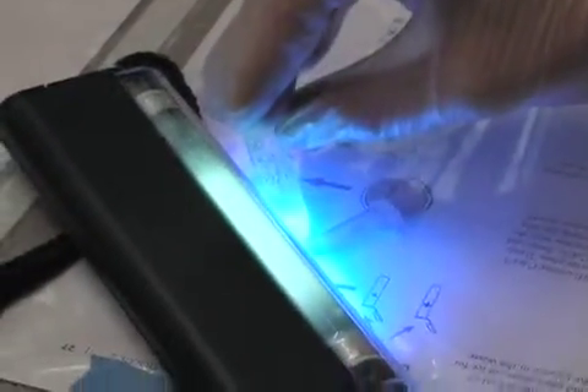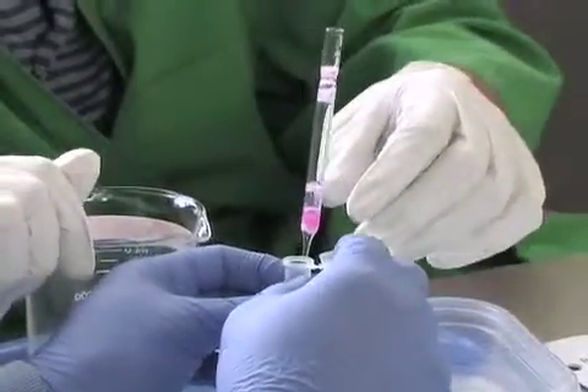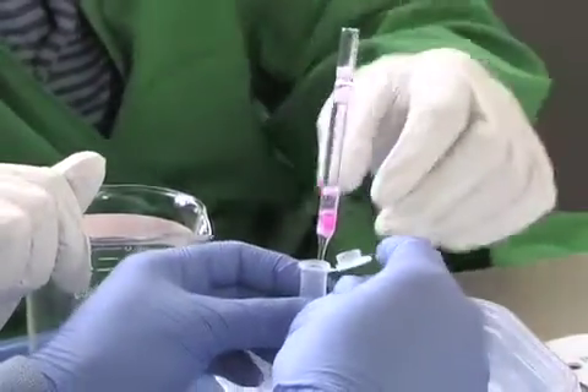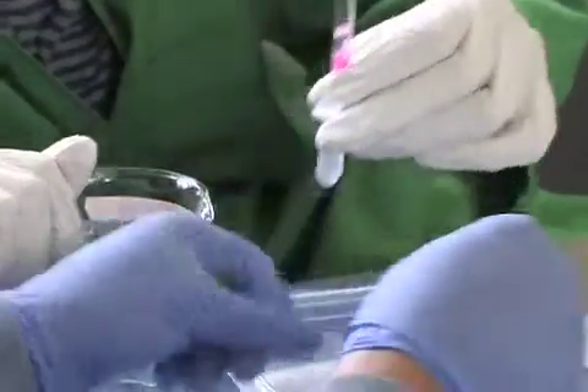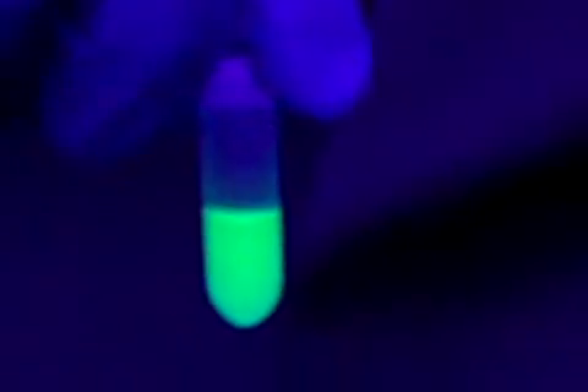To check if the fluorescent proteins fluoresced, they were held up to a UV light. If the protein fluoresces after being exposed to the light, then you purified your proteins by separating the fluorescent proteins from the bacterial proteins as thoroughly as possible. The more pure your result is, the brighter it should fluoresce.